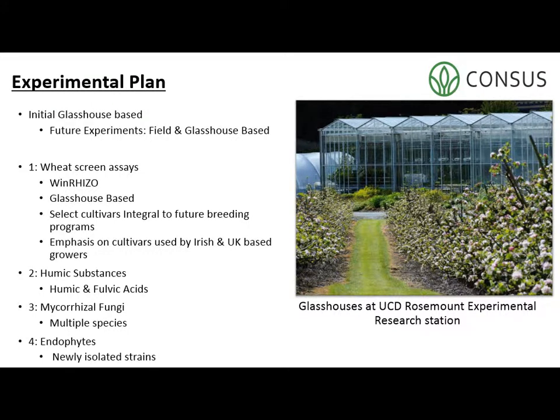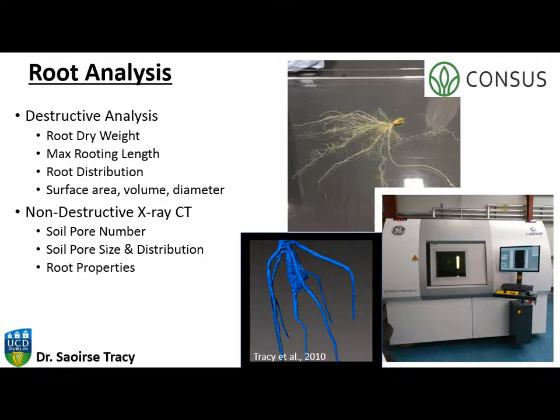He's going to start off in the glasshouses. These are the glasshouses we have at UCD, and he's going to first of all look at the glasshouses and then move this into the field and then do some field trial experiments. Again, using the same pipeline of CT scanning with WinRhizo scanning.